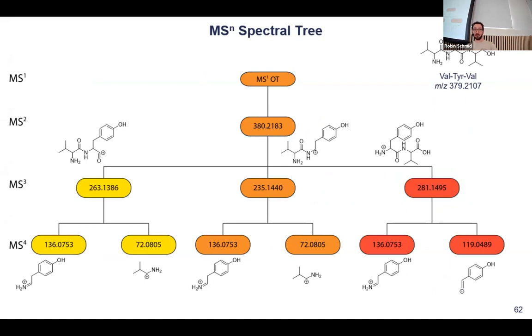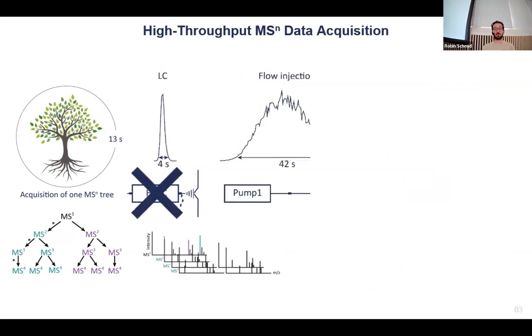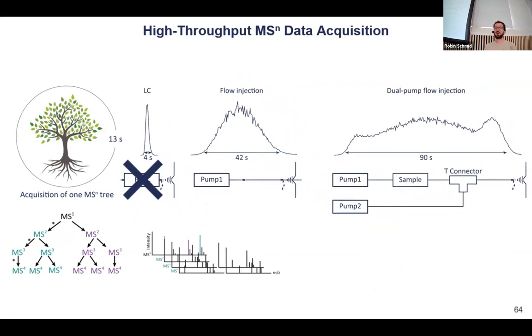And going into MSn, I'm going to skip over very quickly. We can, again, do multi-stage fragmentation. So we select a precursor and then select the next precursor and so on. Because Corinna is very interested in whether that actually helps us annotate the compounds more thoroughly, and maybe annotate even substructures, she developed a method here. So if you want to do the same, you can reach out to her. It's not very applicable to LC-MS, but it's very much more a structural elucidation method.